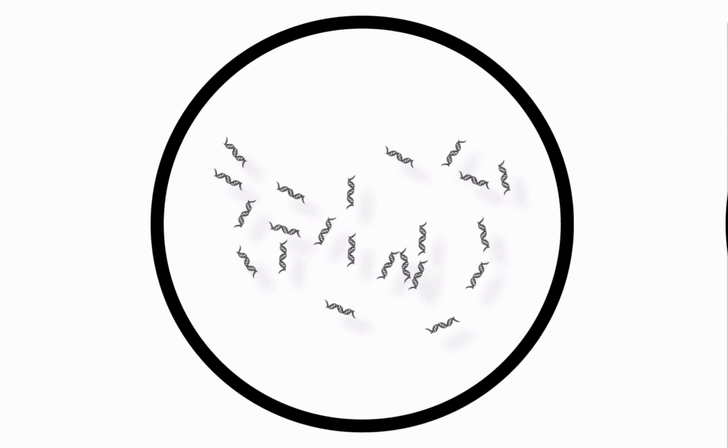The concentration of RNA from a single cell is of course much lower than what you would get from a bulk sample. To amplify the transcriptome of each cell, the RNA in each well is reverse transcribed into cDNA. cDNA is basically a DNA molecule that has the same exact sequence as the RNA it derives from, so it carries the same information.